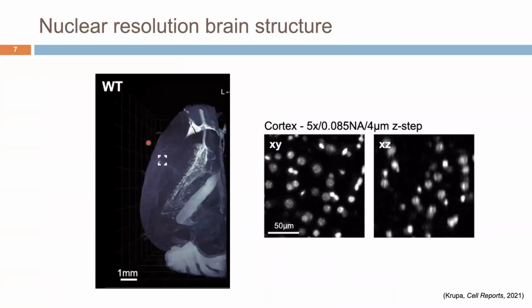So this is an example of what a tissue-cleared mouse brain hemisphere looks like. At the top of the image is the rostral side of the brain where the nose is, the lateral side where the ears are, and at the back of the brain, you can see the bright folds of the cerebellum. This image is quite zoomed out, but labeled with TO-PRO-3, which is a nuclear marker. Here you can see that the brighter the image is, the higher the density of the nuclei. So you can see, like in regions here of the hippocampus, there's a really dense number of nuclei.